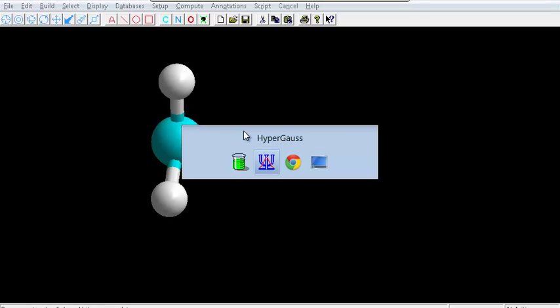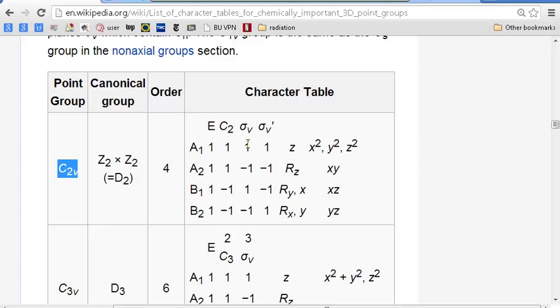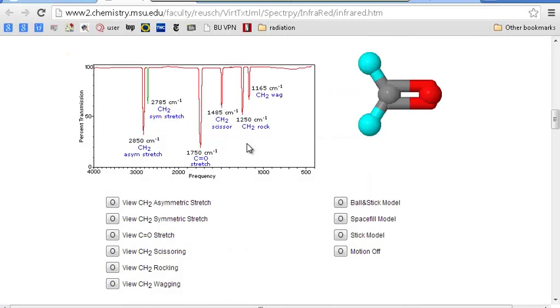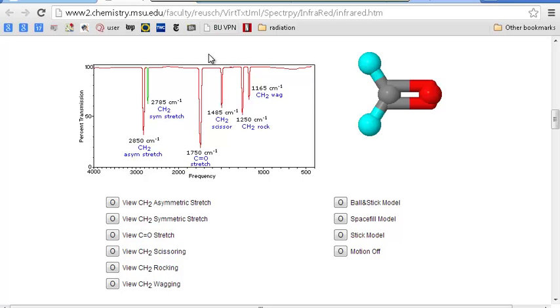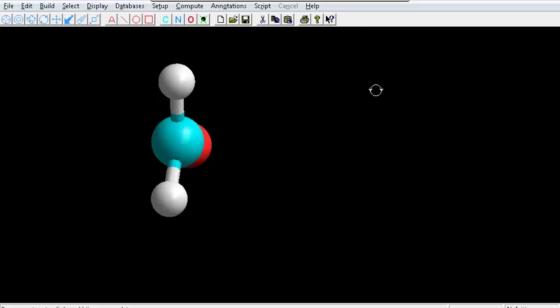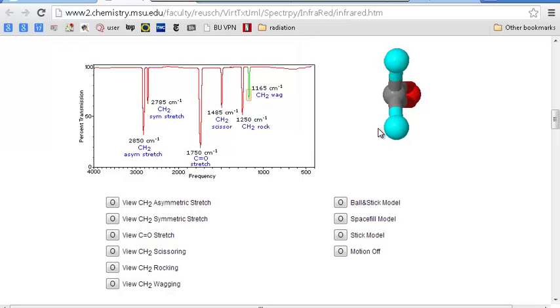If we go to a website which purports to identify things like that, here we have this is called a CH2 wag. Let's see, that's identified as a CH2 wag. So these atoms, as we saw in HyperChem, yes, that was wagging there. So yeah, that's right. But really, it's not just the CH2 that's moving.